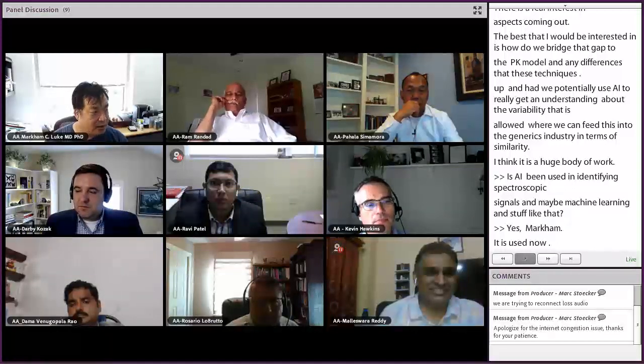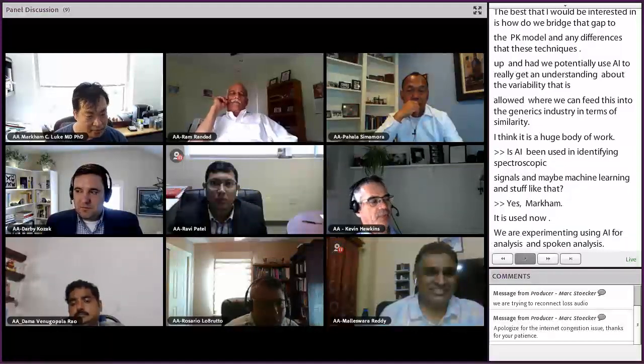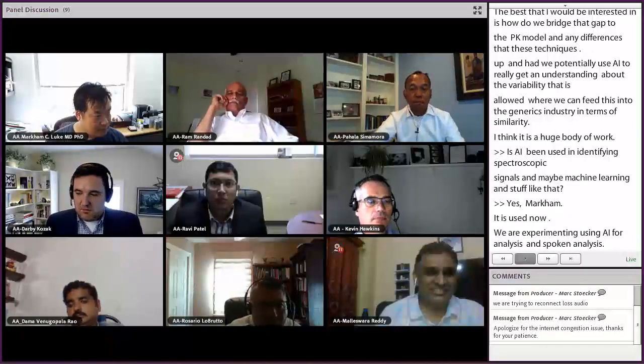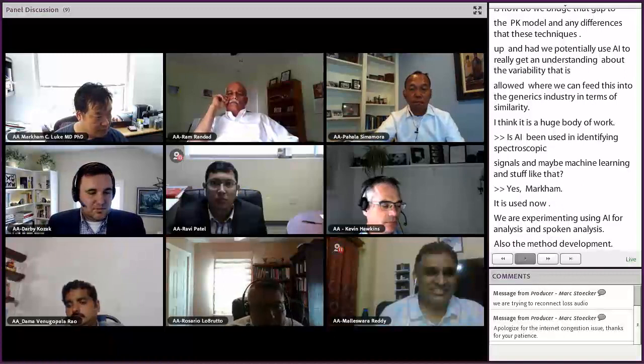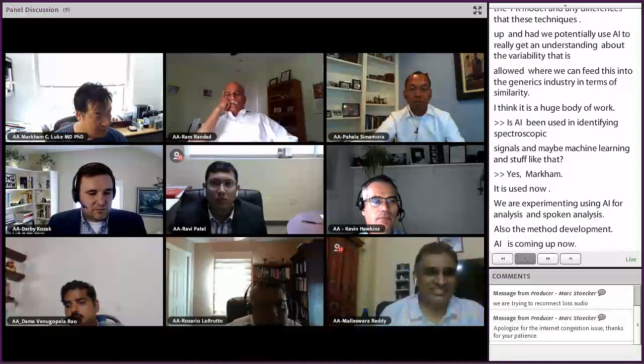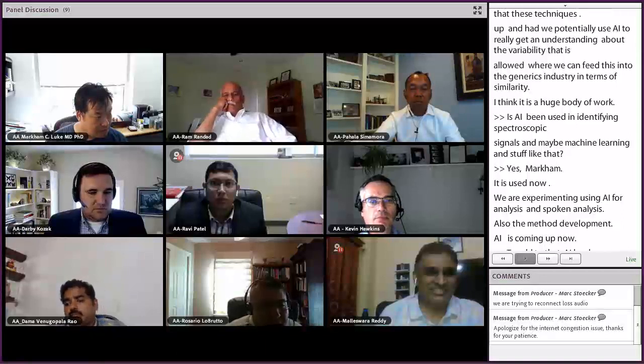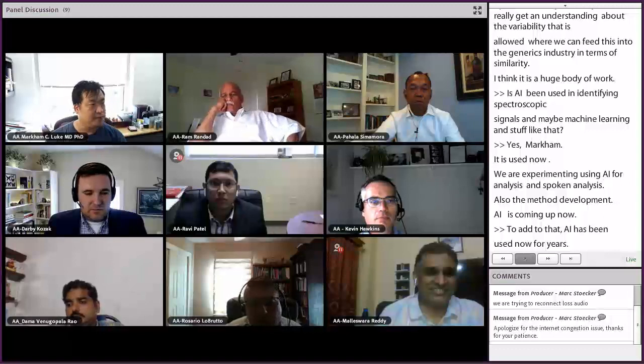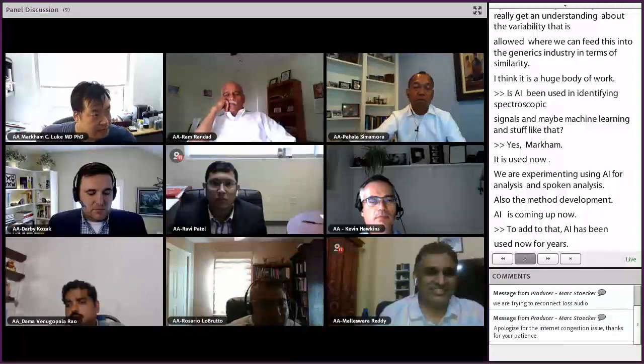Excellent. I mean, to add to that, AI has been used for years, right? When PAT first came out, and you're doing chemical imaging, and you're looking inside tablets and things of that nature, Raman confocal imaging and NIR chemical imaging. So it's been used, and I think it's getting a refresh now. I think you mentioned the chromatography. It's been used for peak tracking and other things as well.